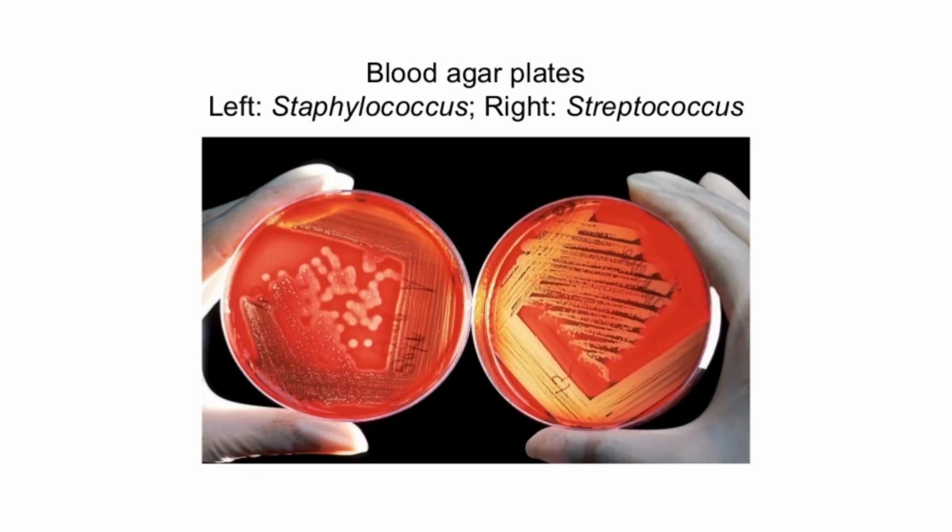In our exploration today of enzymatic function, we are going to focus on separating two major groups of gram-positive bacteria, Staphylococcus and Streptococcus species. Both groups contain pathogenic and relatively non-pathogenic species. They present us with an opportunity to explore biochemical identification in order to determine which species are present and whether or not there's a need for concern.